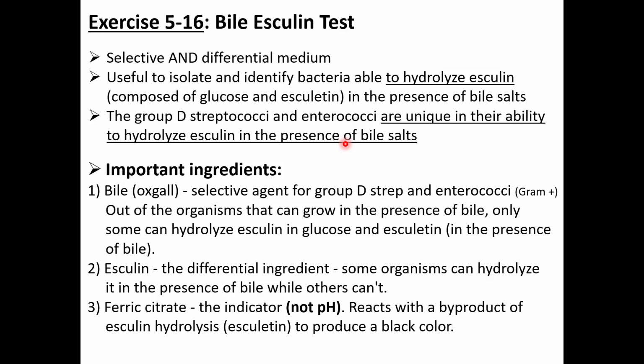Because the microbes will be present throughout our entire small intestine, some of them may not even be on that side because they may not be able to break down anything because of the bile salts. But this group of bacteria, they can do that. They can take this compound right here and break it down in the presence of the bile salts.